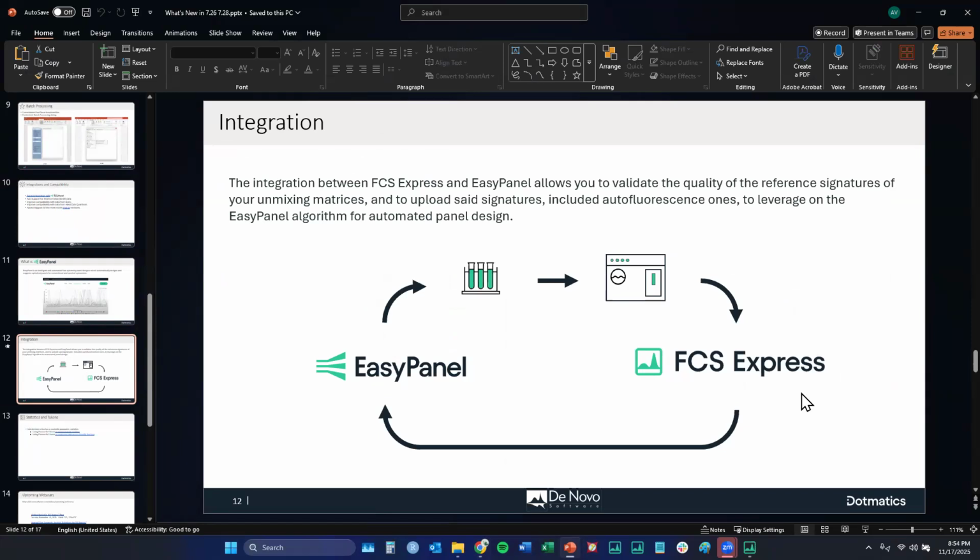So a question: spectral signal depends on the instrument configuration and detector setup. They are agnostic in the sense that, unless you ask them to, they do not prefer any manufacturer. So if you have an instrument, you can set that instrument and that's it. BD FACSDiscover.